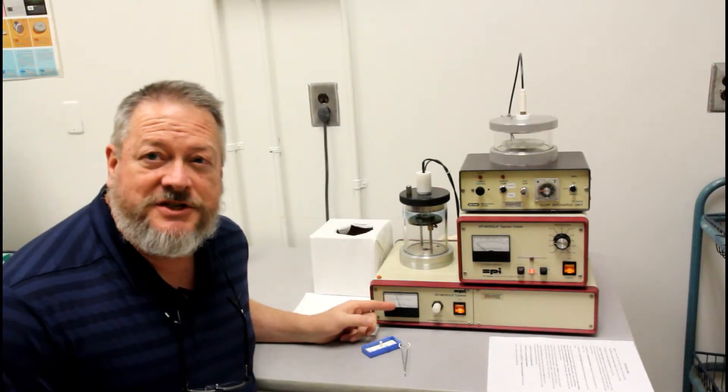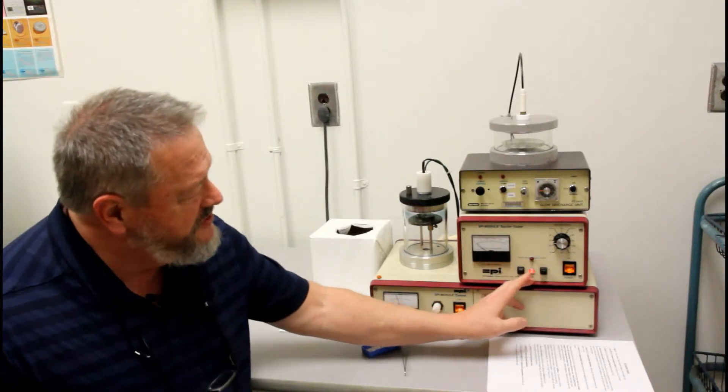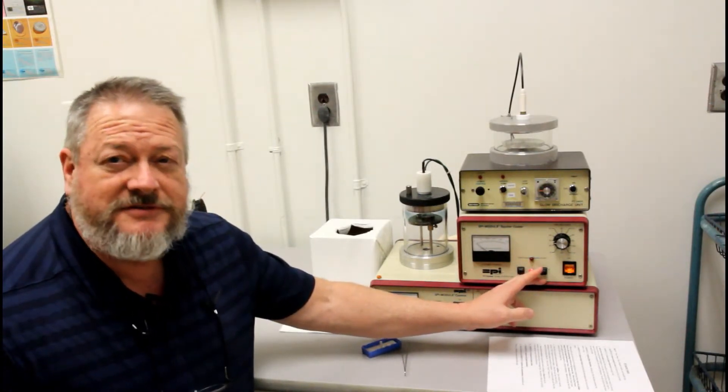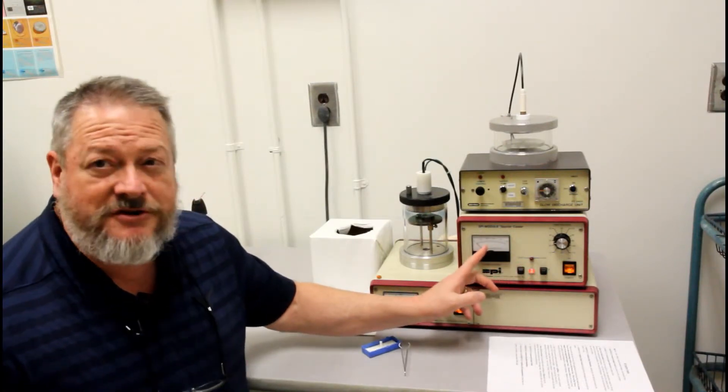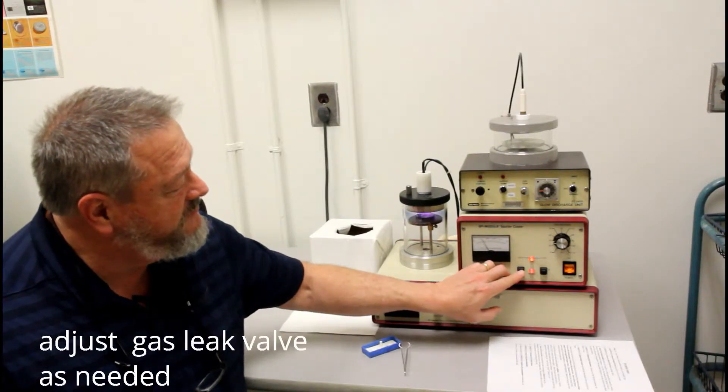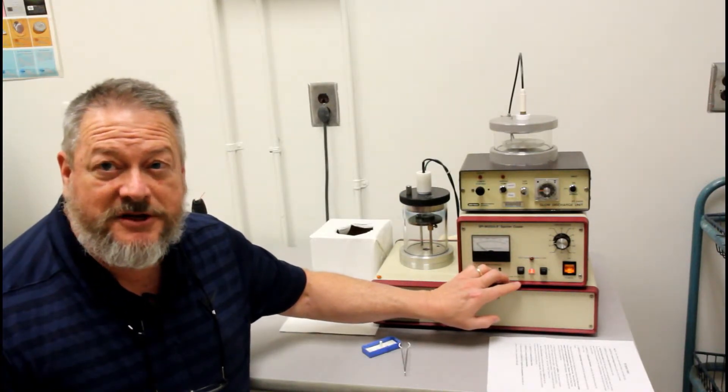Once the vacuum has reached an appropriate amount, you'll want to test this, and so you'll push the test button. There's a test and a start button. The test button, as it runs, will allow you to see whether or not you're getting 15 milliamps or not. And we are, so I'm going to go ahead and start sputter coating.